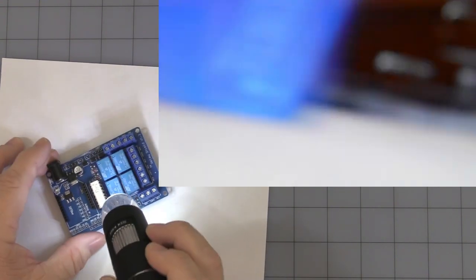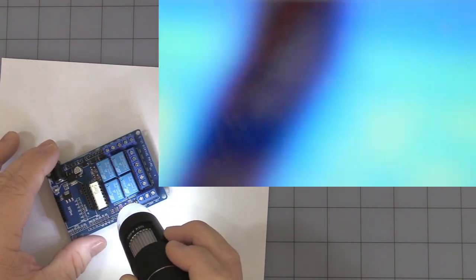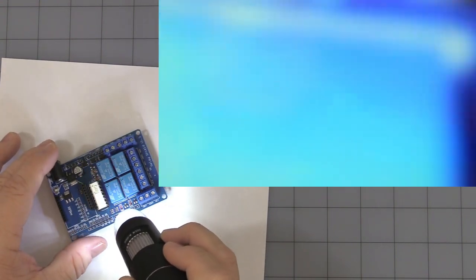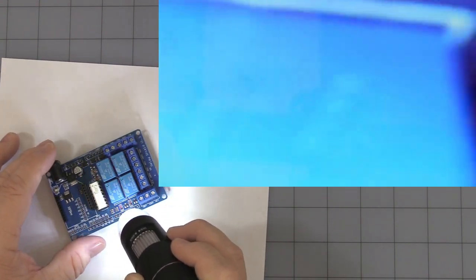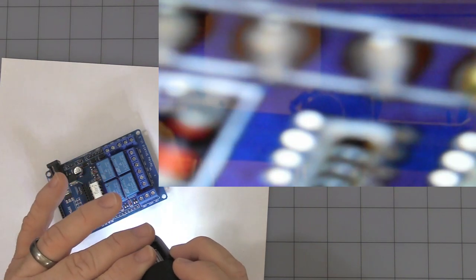In fact, let me move down to this lower corner here and see if we get the split screen to work and you see what I'm doing with it. Okay, actually I'm holding it upside down. Let me turn this around and I'm adjusting the thumb wheel.